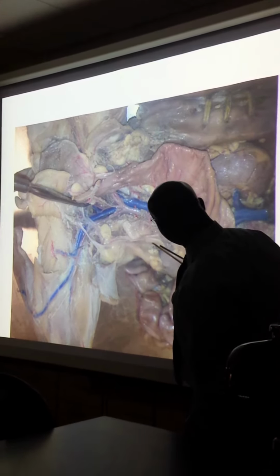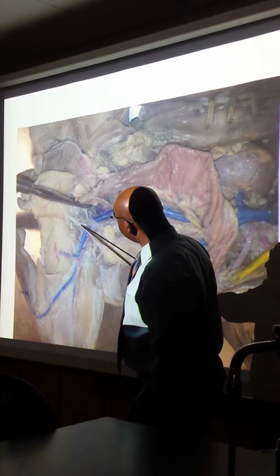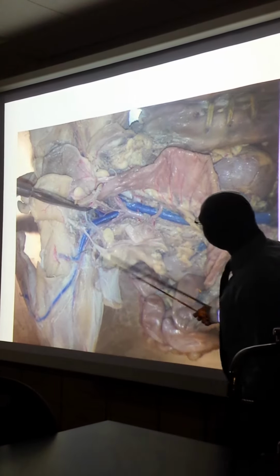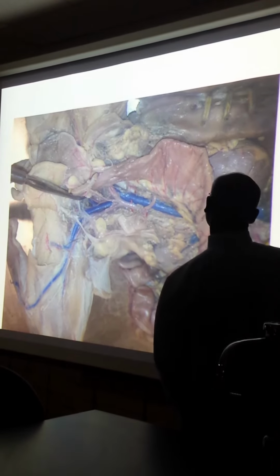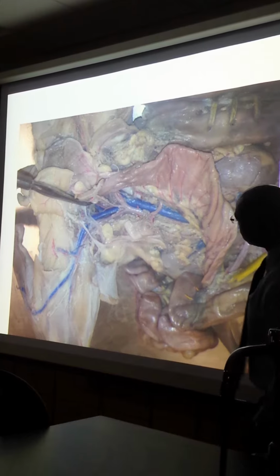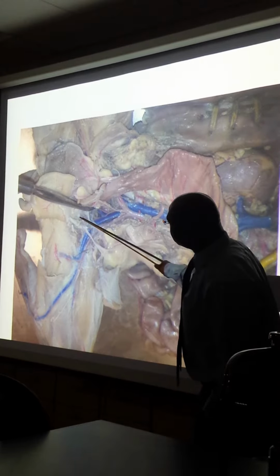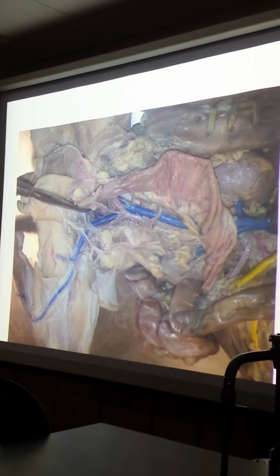And you could see this is the internal iliac, internal spermatic, and then goes into the spermatic organ. The remnants of the testes and stuff. Covered by this is the gracilis. Oh, yeah, it's the gracilis, and up here is the sartorius. Right? See, I had to fold it back so you can see that, and then put that in there. But somewhere in there with this little red, that's where the deep femoral artery and vein is.